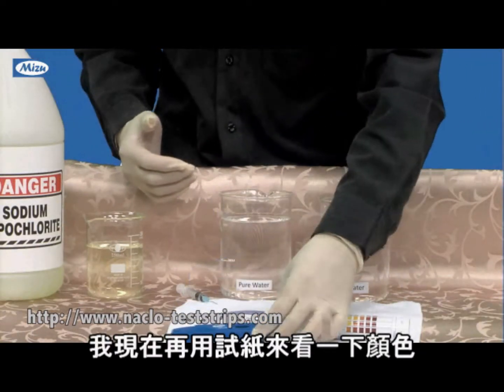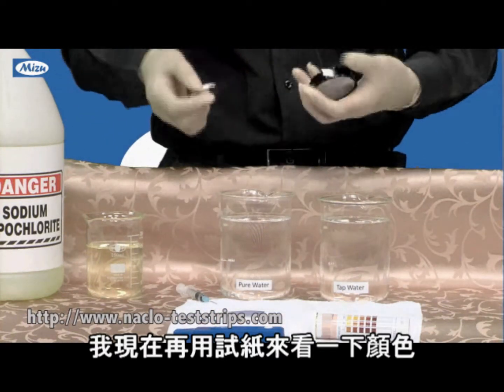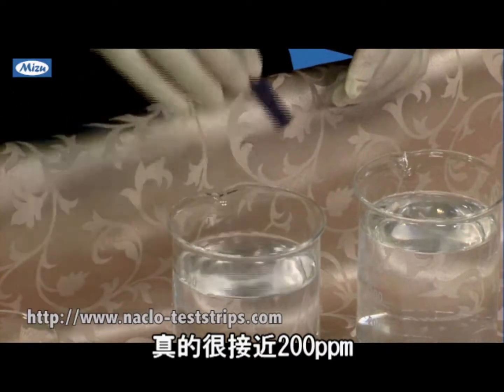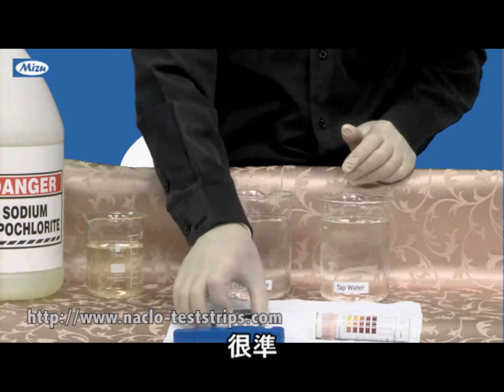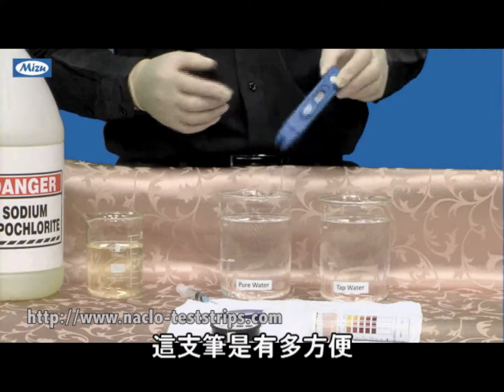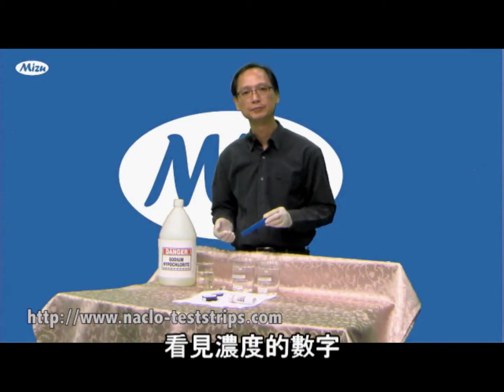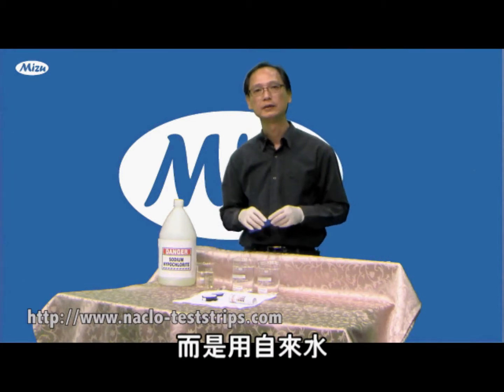So I compare with the test strips here — that is the color for 200. Exactly. So you can see this pen can exactly tell you the number, the concentration of the sodium hypochlorite.